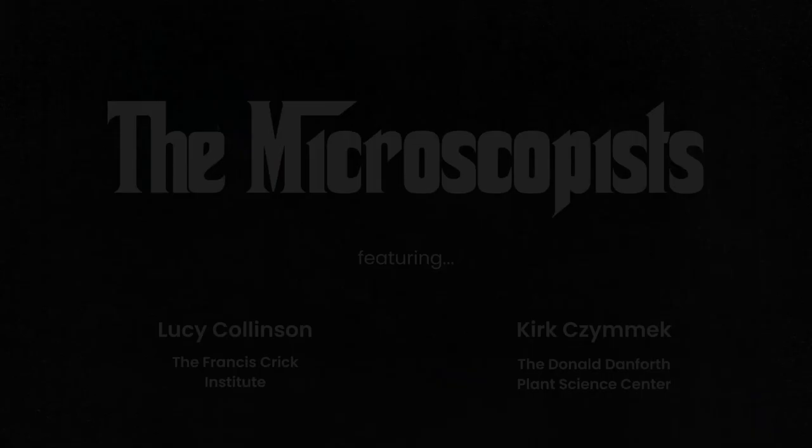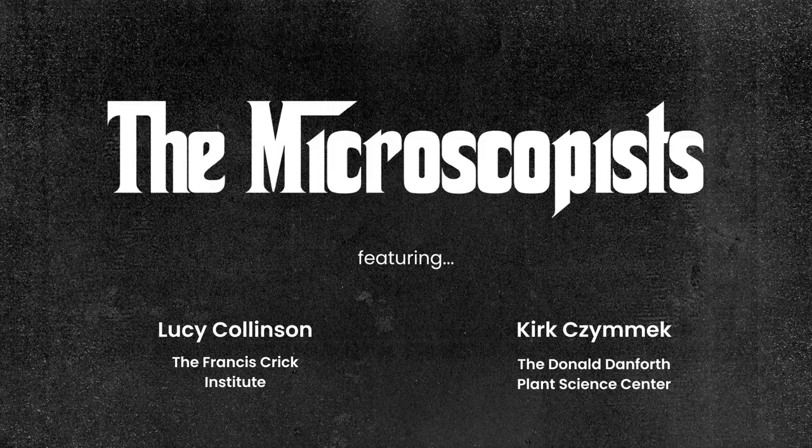And what publications should you go and look at if you're just getting started? I think Lucy has put out a primer last year. Yeah, so that was in Nature Reviews Methods Primers. We were really lucky. We got some key experts from across the volume EM pipeline to write on it.